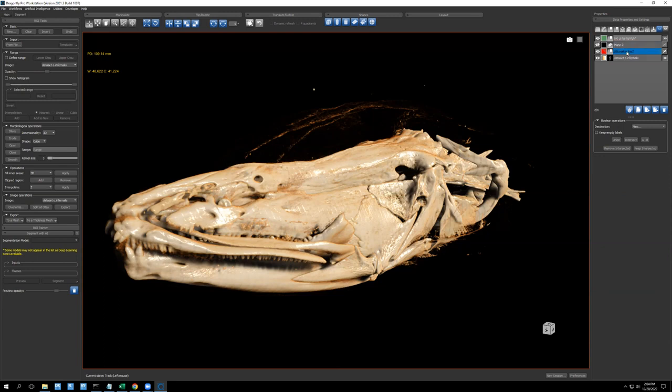So let's say I had the Hyopalatine arch as a segmentation, and then I made the premaxilla a separate segmentation. Let's say that was the premaxilla and that was the Hyopalatine arch. I would say all I have is A minus B. So if you wanted to remove something, B, you make sure that's the second thing you click. It shows A up here and B up here, and then you would say, I want A minus B. That creates a new segmentation that is whatever A is with B removed from it.